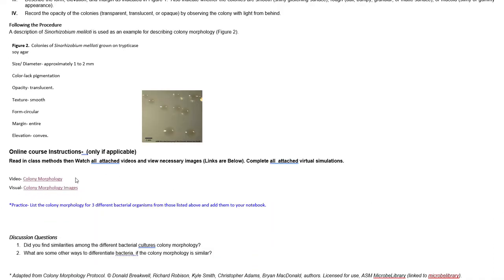Guys, here are the videos. You really need to go and watch these. Colony morphology is just going to describe what I've just said, but it's good to hear it from a different person. And then this visual, I would definitely go there because they're going to show you different colony morphologies.